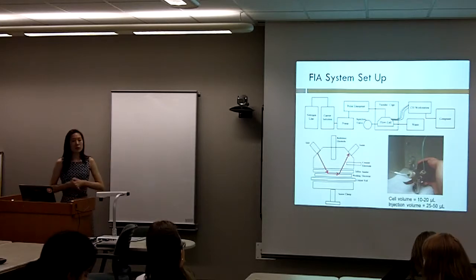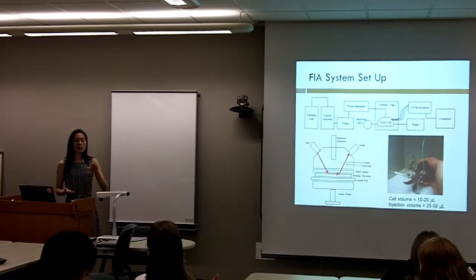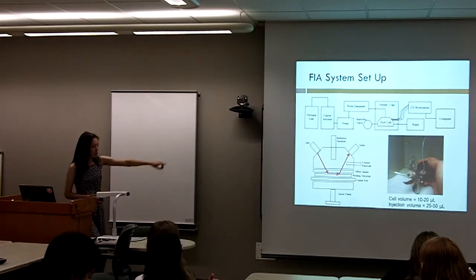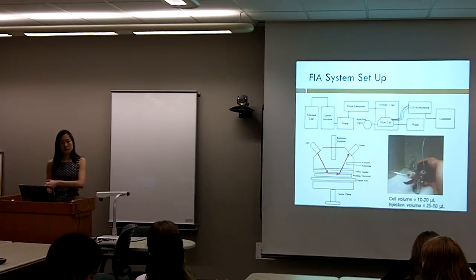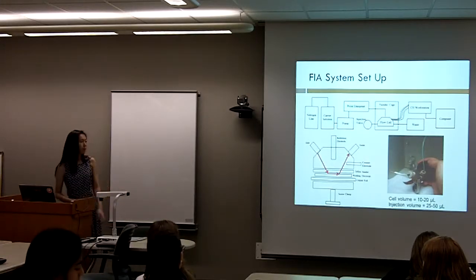I actually use a 3-electrode flow cell. There's a reference electrode, which I use a silver-silver chloride electrode. And for that one, it's held at a constant and known potential against which all other measurements are made. The working electrode, which you can see down there, that's your glassy carbon or diamond or TAC electrode, and that's where the reaction takes place. And then you have a counter or auxiliary electrode, which is just the platinum wire.